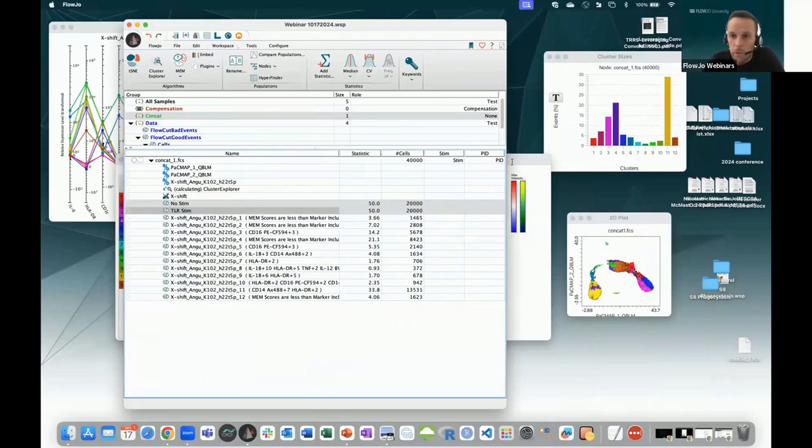Right. Yes, FlowJo does not work on Linux. You're correct. However, the R package FlowWorkspace from the RGLab says it can replicate the gating from FlowJo using the FlowCut functionality. I'm not aware of that, so I cannot answer your question. I don't know about that R package. Never, didn't try it.